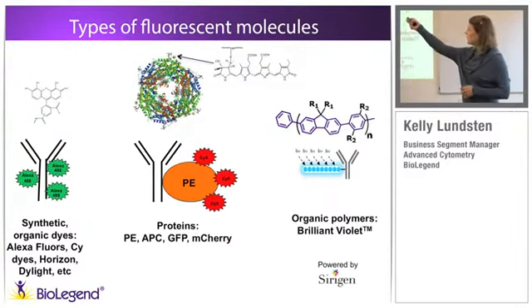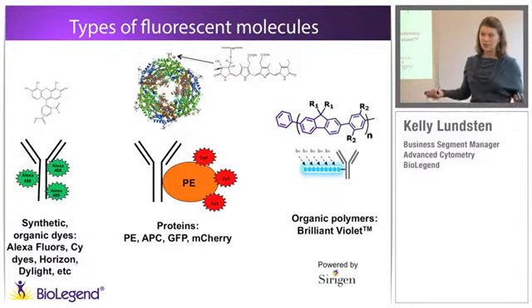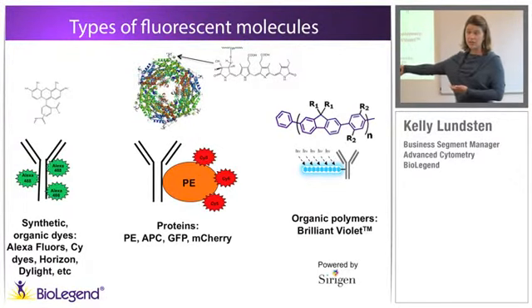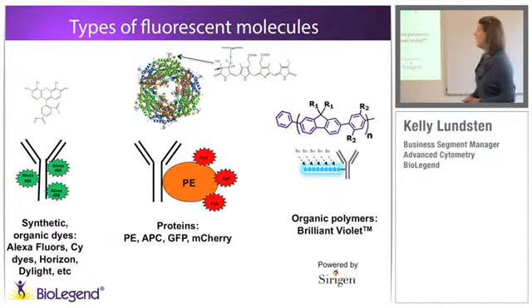But what you should be able to see from the structure is we have a ton of bilins in there. You can have anywhere between 15 to 20 bilins embedded in a particular PE derivative. And that's a one-to-one conjugation with your antibody, so you're benefiting from the fluorescence of a lot of fluorophores.